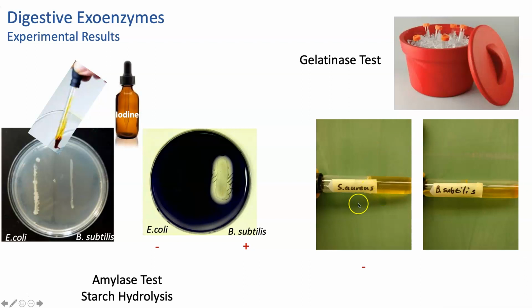Bacillus subtilis, however, after putting it on ice for 20 minutes, notice that when I put it vertical or horizontal here, you see that it's liquid now, right? It remained liquid even after putting it on ice. Therefore, these experimental results are positive. Okay.